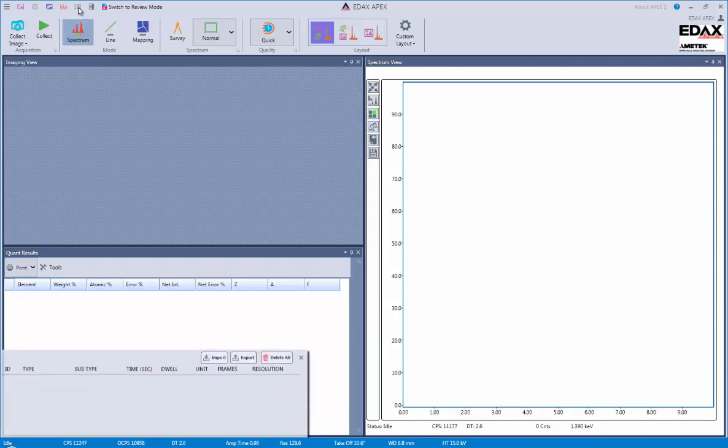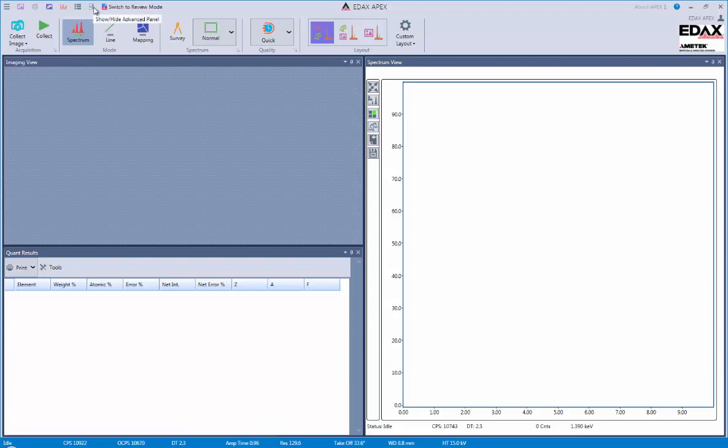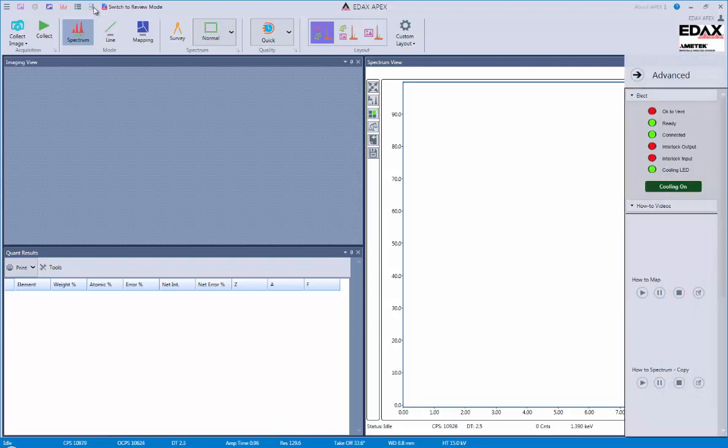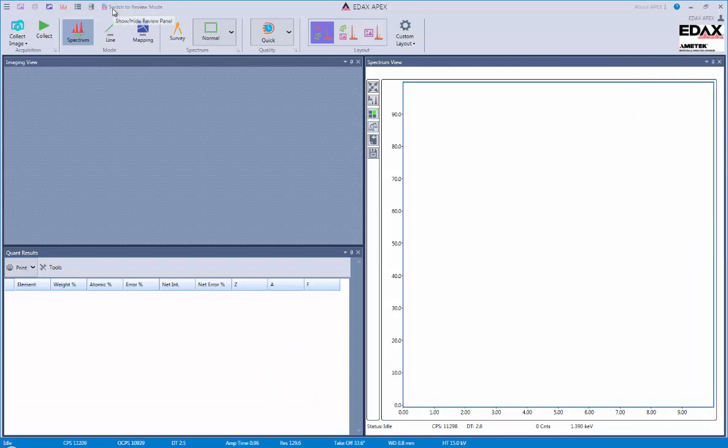We could also view the scan list, which will be a very important function for us as we do multipoint analysis. We also have an advanced panel that gives us some working areas to control the detector. Finally, we could switch between review and live mode depending upon which type of data analysis we want to do.